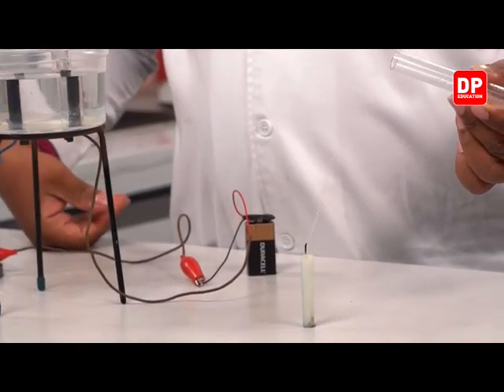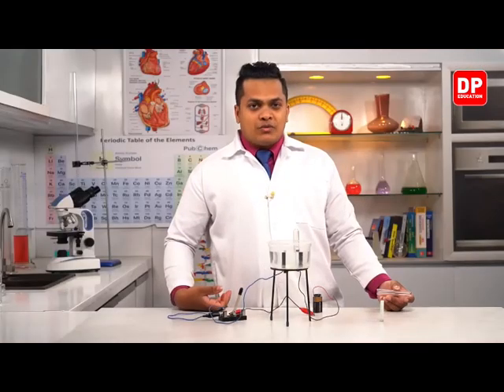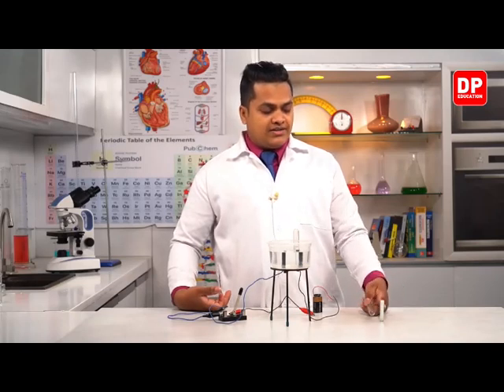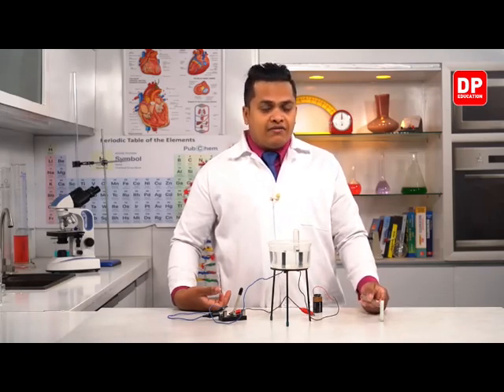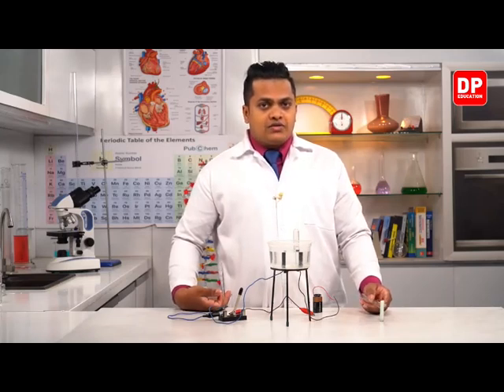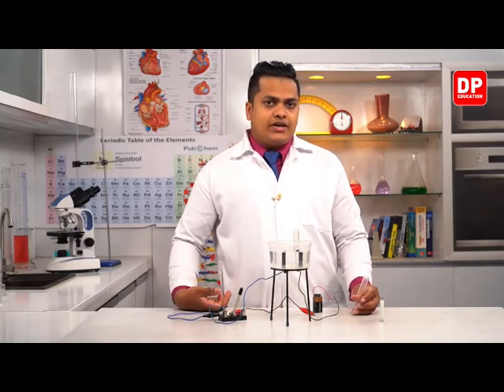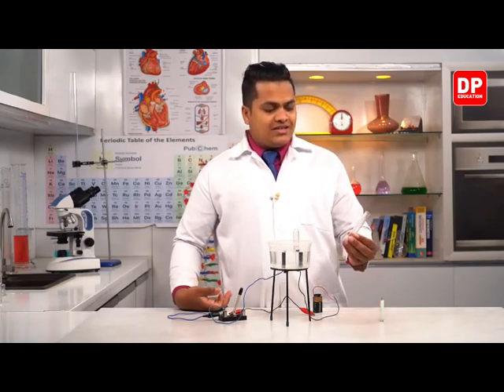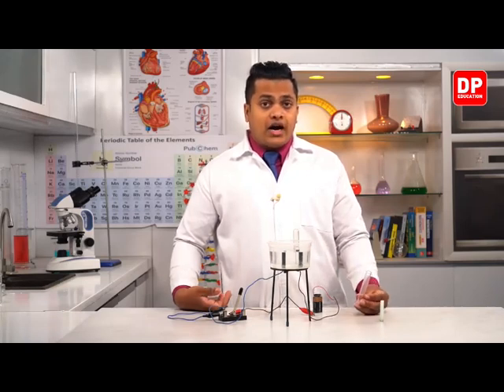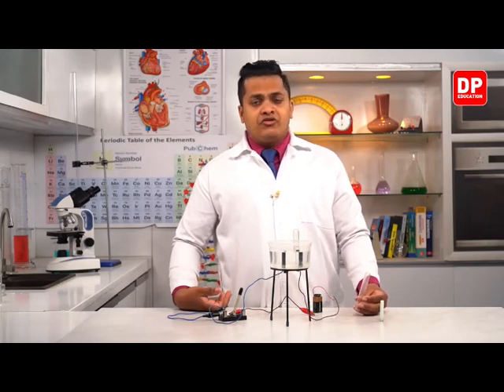So my dear children, it's quite obvious to us that it's going to emit a good pop sound, and as you can see, the candle flame is also going to put off. So what is the reason for that? Because this gaseous container contained hydrogen gas. Hydrogen is a combustible gas.